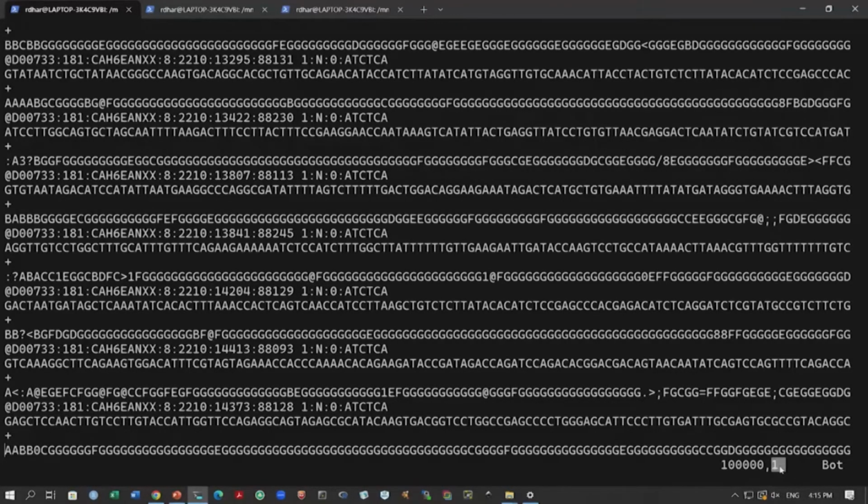So, you will see if we move to the right, you can follow the cursor here, this number changes, right, we are moving into these columns. So, this actually is counting the column number.